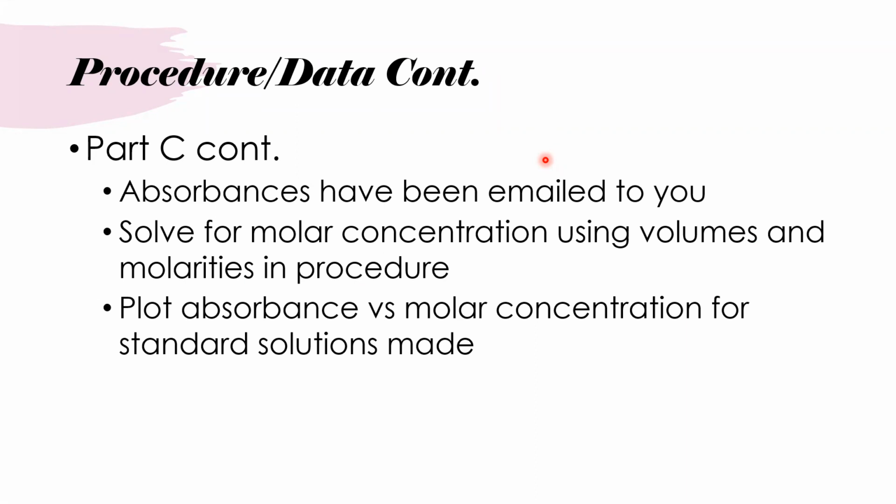Make sure you include that calibration curve plot from Excel or whatever you use. Upload that along with your report sheet and post-lab questions. That also counts for your grade. I need to see that graph.